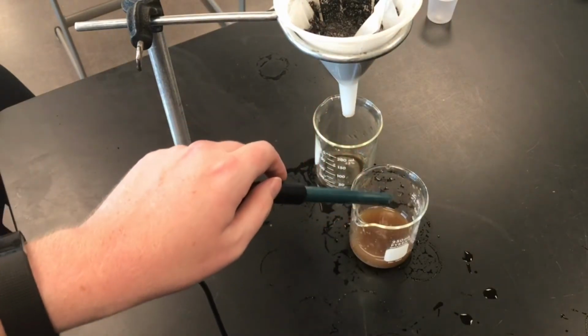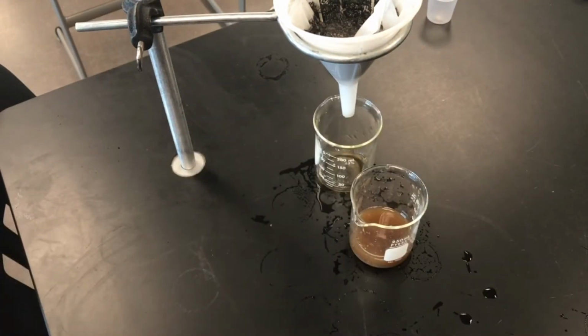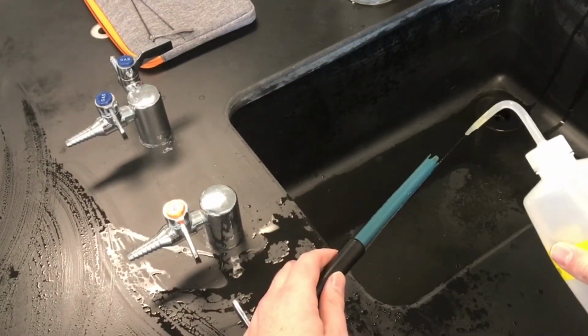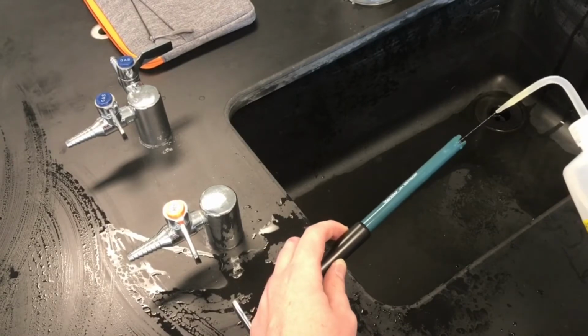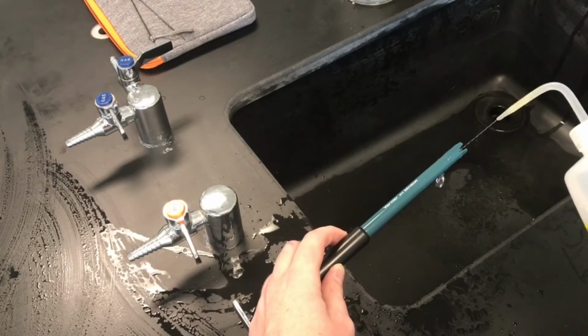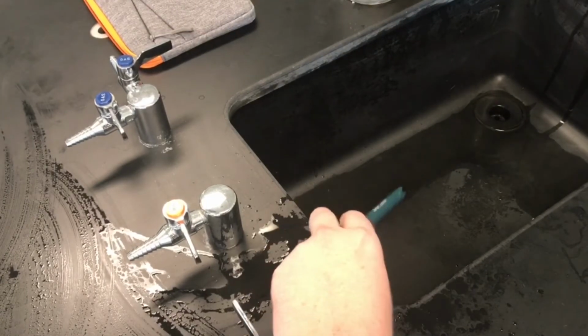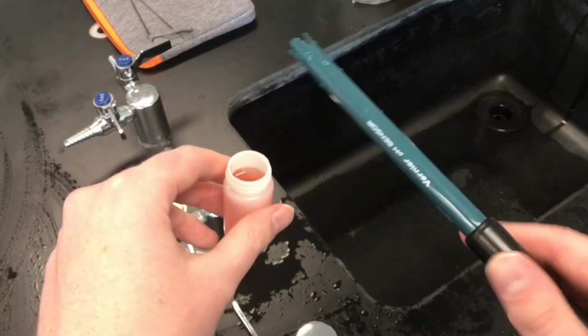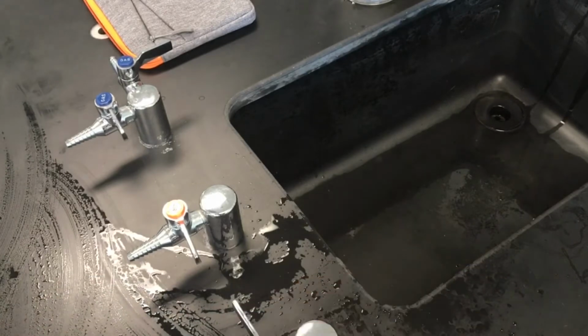So I'm just going to take that out. Again, this is really, really important, especially for this last step here. I'm going to spray off my pH probe. Make sure to get the tip of the probe all cleaned off. And then I'm going to stick it back into the buffer solution here.